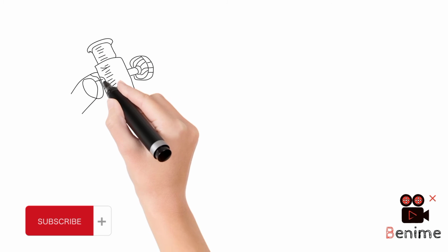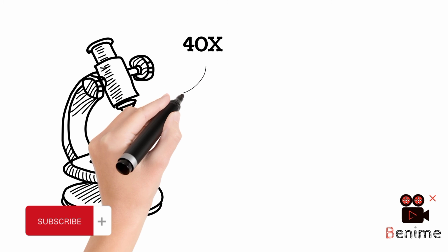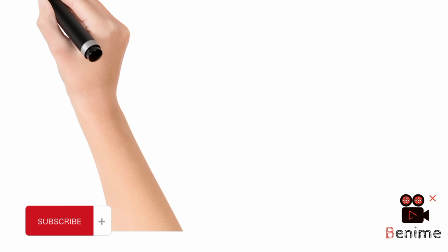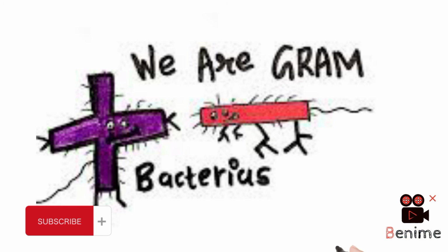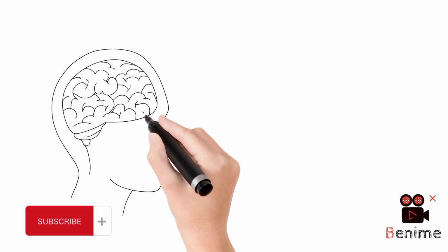Dry the smear after applying the counterstain and observe under a 40x microscope. The bluish color bacteria are gram-positive bacteria and the pinkish color bacteria are gram-negative bacteria. This is a simple Gram staining procedure of bacterial culture.